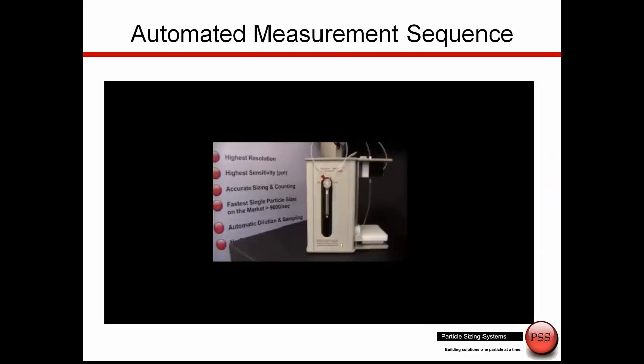In this short video, we see the AccuSizer SIS in action. The sample tube is placed into the sampler. Once we hit go, the syringe then aspirates the sample up through the sensor and takes the number of pulls that has been programmed for the defined measurement.